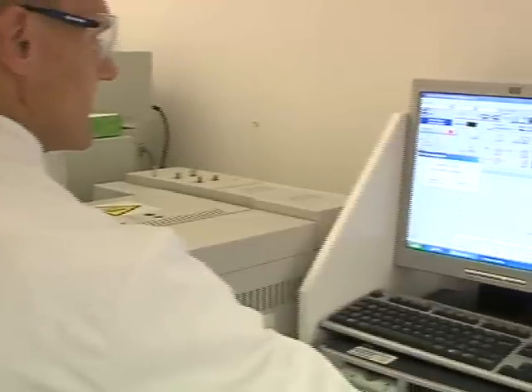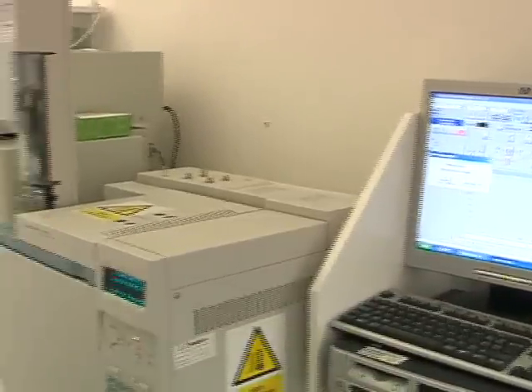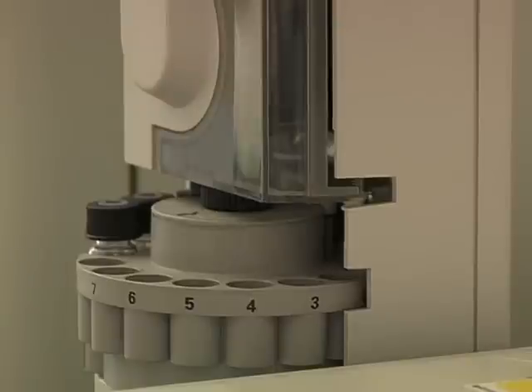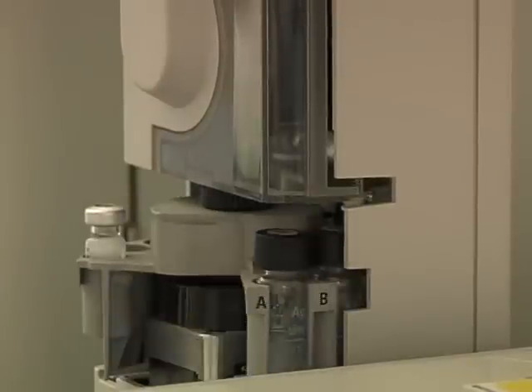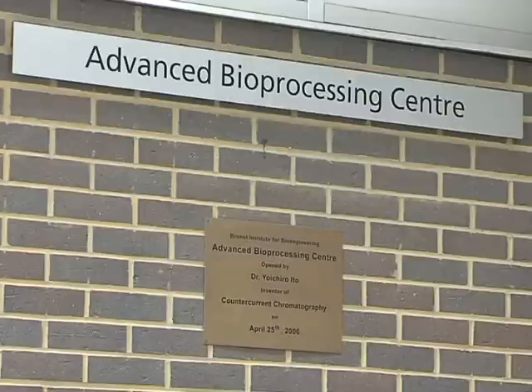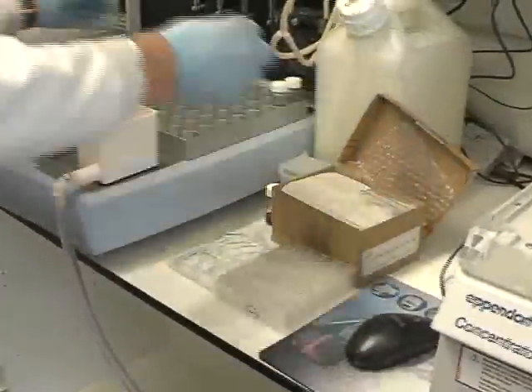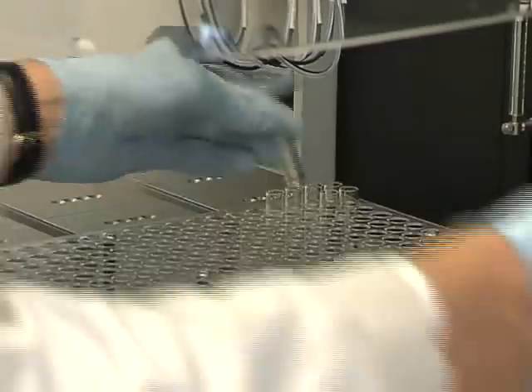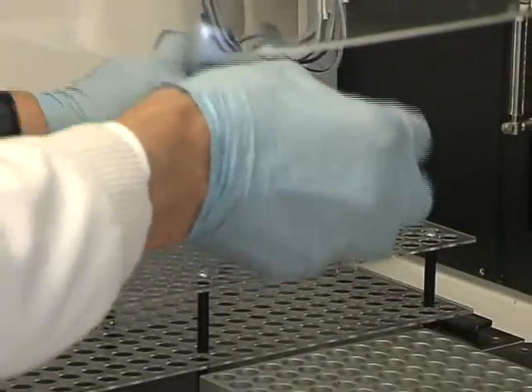In line with most preparative techniques, some preliminary studies have to be performed before the crude material is injected into the instrument. Predominantly, this consists of identifying a suitable two-phase solvent system. At the Advanced Bioprocessing Centre, here at the Brunel Institute for Bioengineering, we've developed a systematic step-by-step protocol that takes an inexperienced user logically through the process.